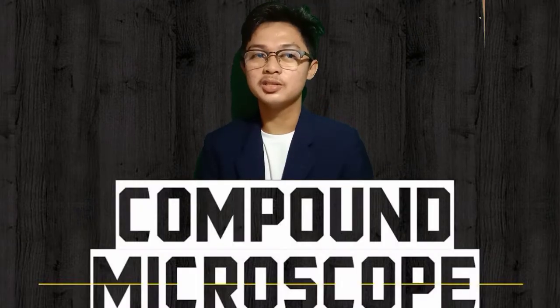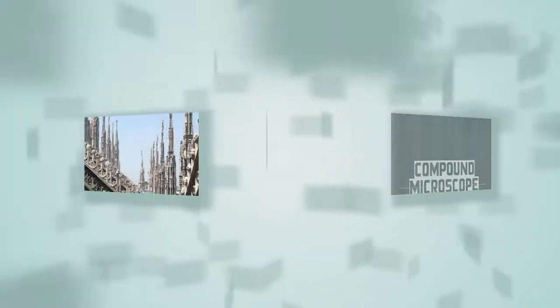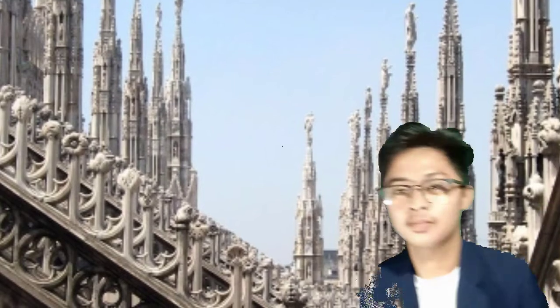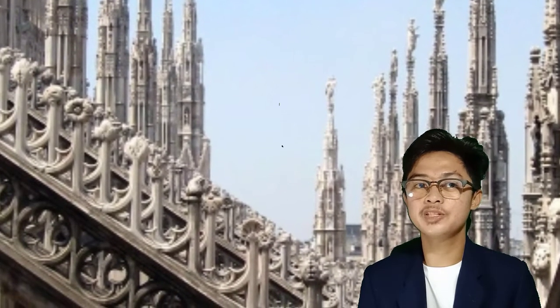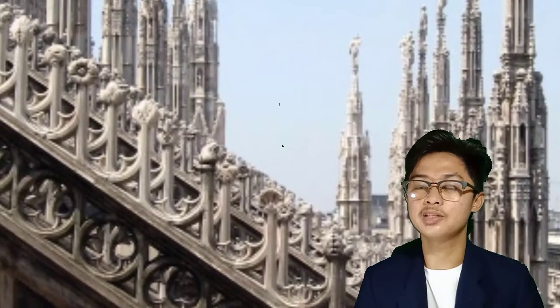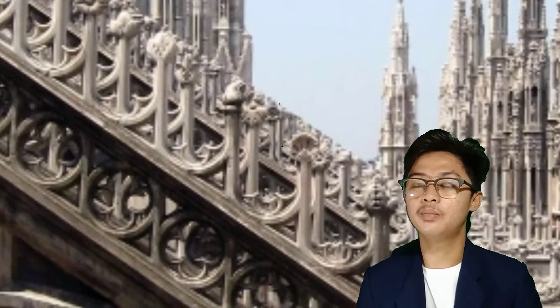Before we indulge in the parts of a compound microscope and its functions, let us go back in time and have a peek at the microscope's evolution. In the 14th century, spectacles were first made in Italy. Italy was the first country to theorize a technology that zooms a tiny particle into a macro scale.